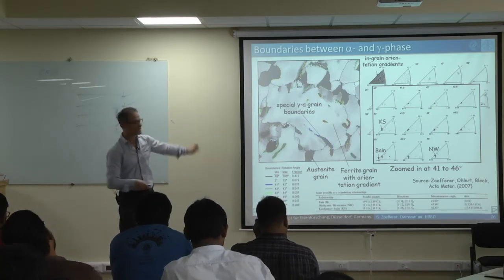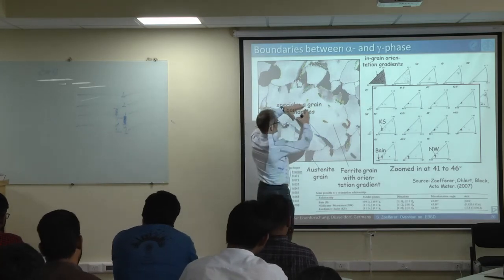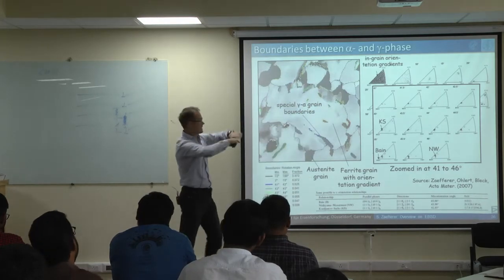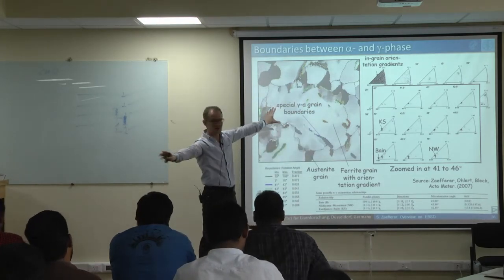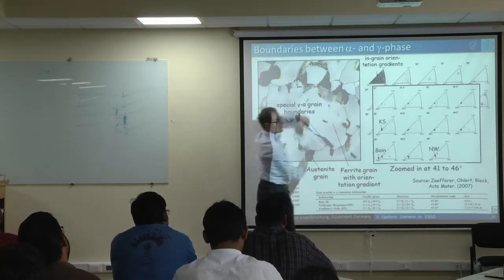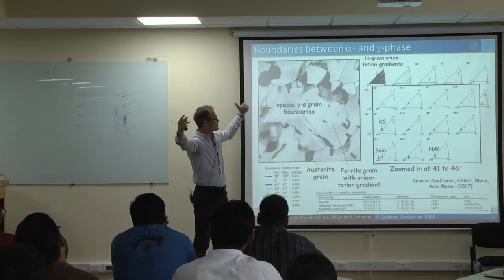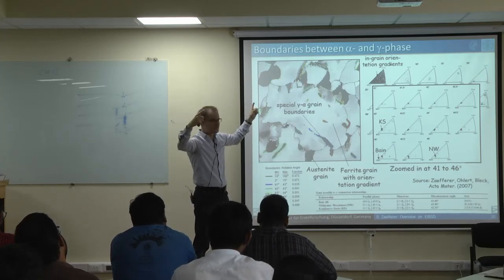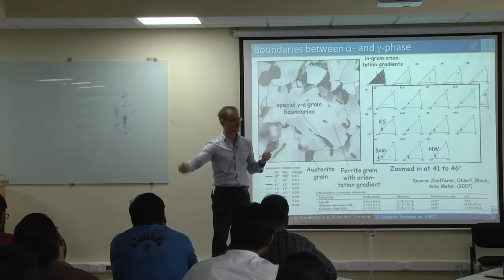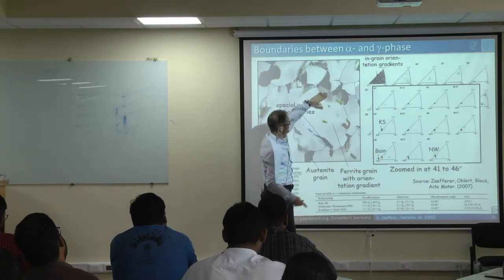It's a bainitic transformation, and this bainitic transformation actually started here in the middle. In the beginning this wall was all austenite, everything homogeneously austenite, and then some little grain started to grow out. As long as the temperature was high, the ferrite just grew, and then the temperature got deeper and deeper, and suddenly it started to transform as a bainitic transformation. And that's the moment when we see the formation of these gradients here.